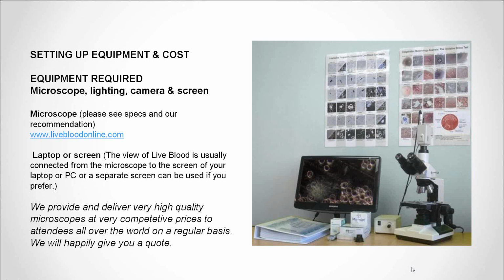So we often find microscopes advertised for live blood analysis and advertised for dark field, but when you look at the specifications, you can see that it really won't be up to the correct standard to be used for proper live blood practice. For example, a lot of these systems would have a USB camera that would plug directly into your computer, which seems quite convenient, but the problem with the USB cameras is that the frame rate on the video is actually not so good.